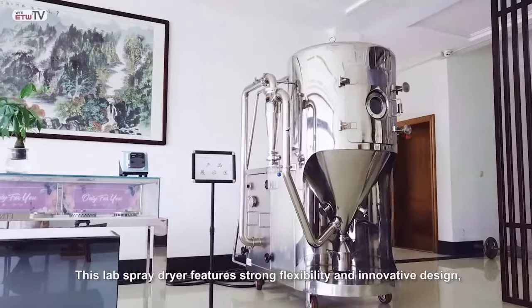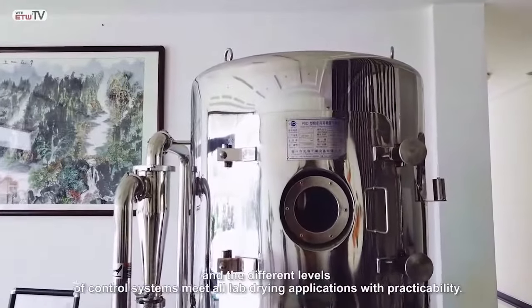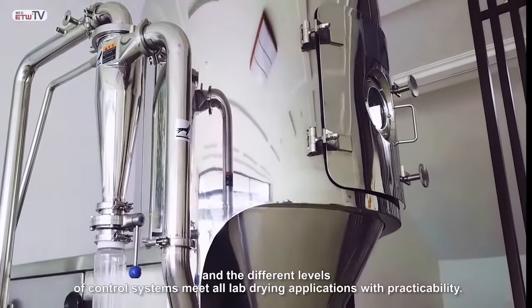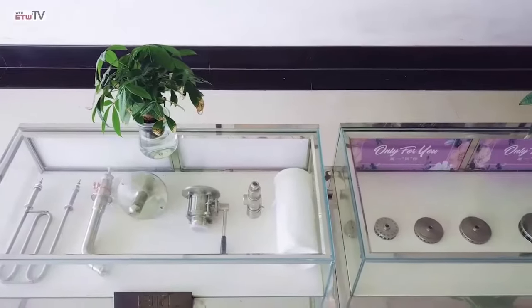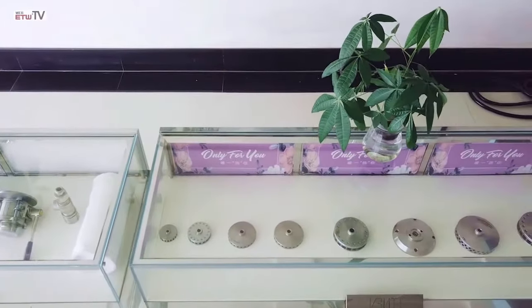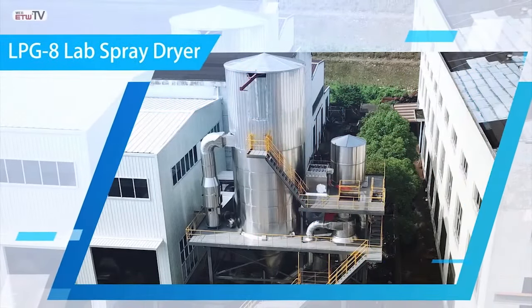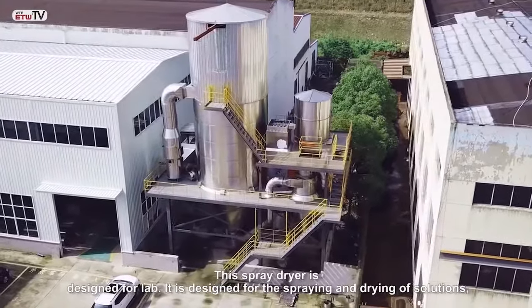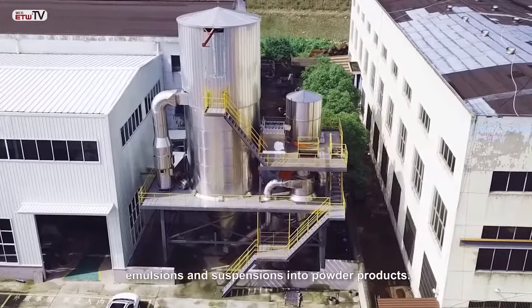This lab spray dryer features strong flexibility and innovative design, and the different levels of control systems meet all lab drying applications with practicability. It is designed for spraying and drying of solutions, emulsions and suspensions into powdered products.